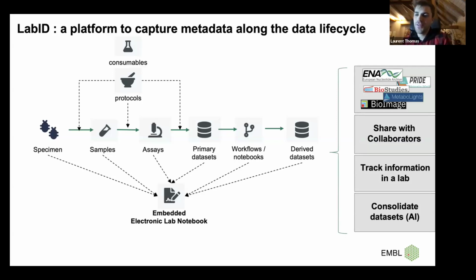The platform has several benefits and applications. One of them is facilitating the deposition of data into repositories, so research data repositories. In our communities, it would be, for instance, ENA for genomics data or BioStudies, or the BioImage Archive for microscopy images. And all of these repositories also expect quite some level of metadata from any steps of this workstream, let's say. And so the LabID platform makes it easy to compile this information for submission.